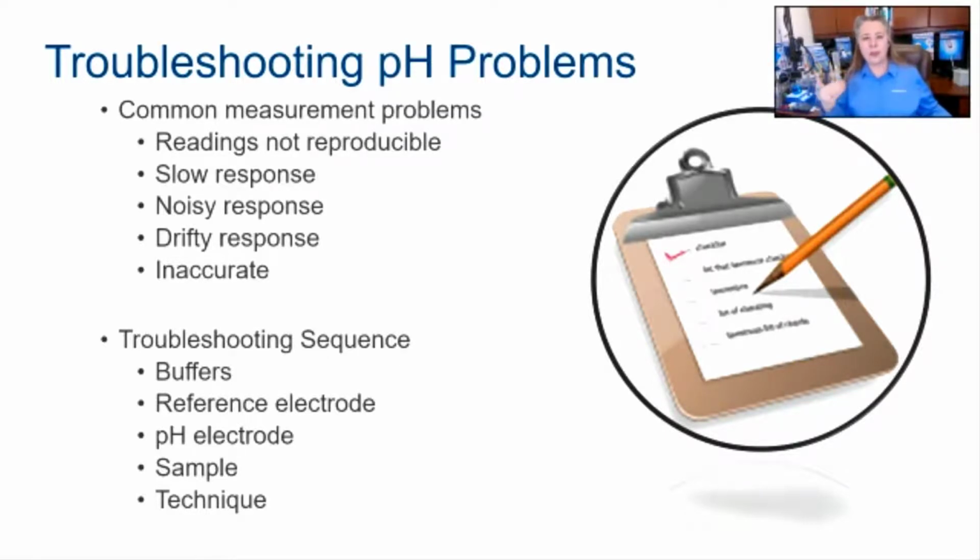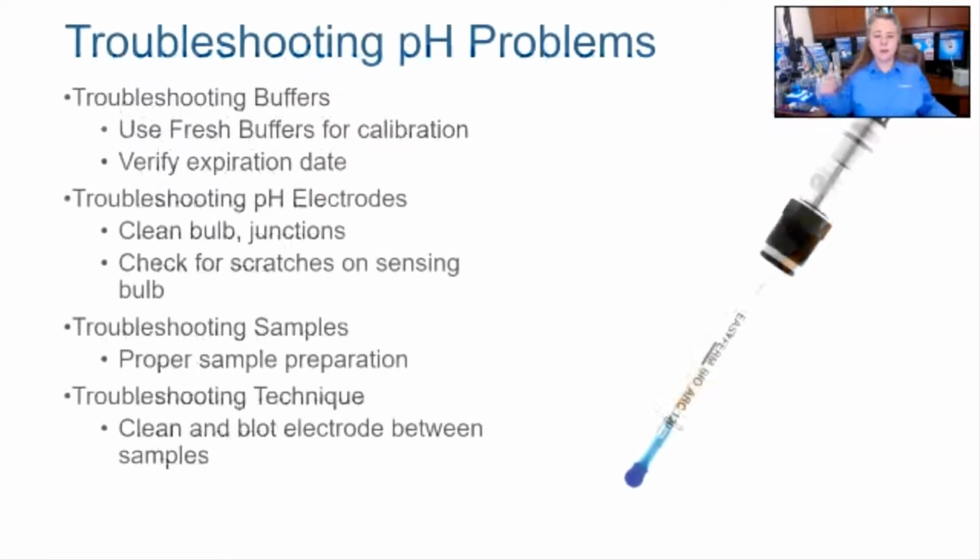Then finally, consider your technique. Are you stirring? Do you have temperature isolation with your mixing plate? Are you rinsing? Are you blotting between? Are you cleaning? Have you checked the cleanliness of your probes? Again, this is a list of all the things I just talked about.